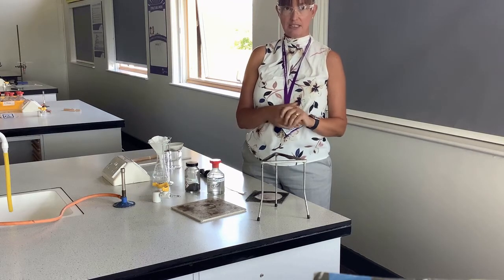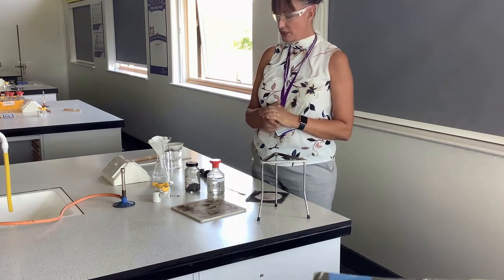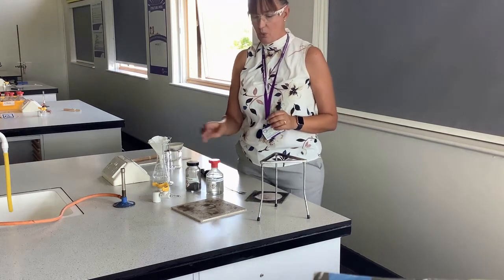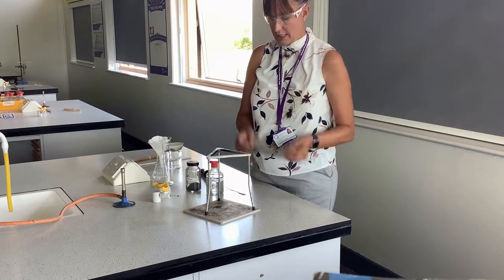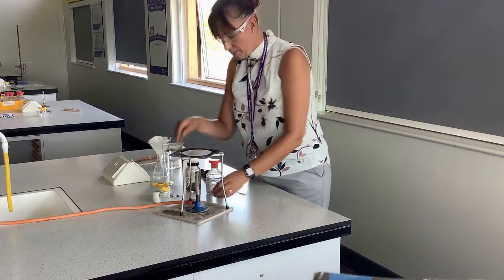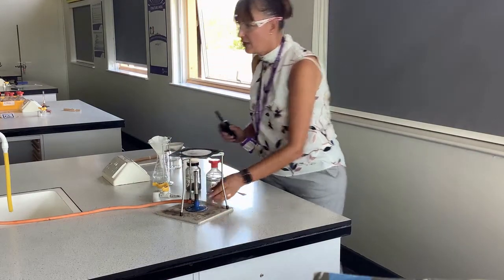So in the second part of the practical we will need to remove the salt from the water. First of all we're going to create our salt, and to do that we are going to need a Bunsen burner. I have a heat mat, a tripod and a gauze, and a Bunsen burner — making sure that when I light it, I light it on a yellow flame.